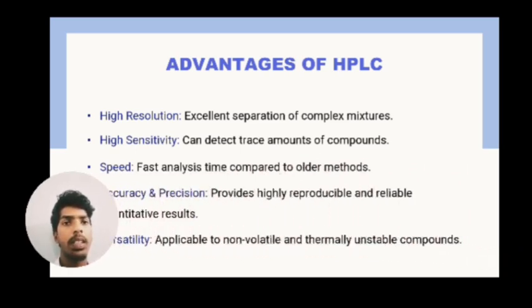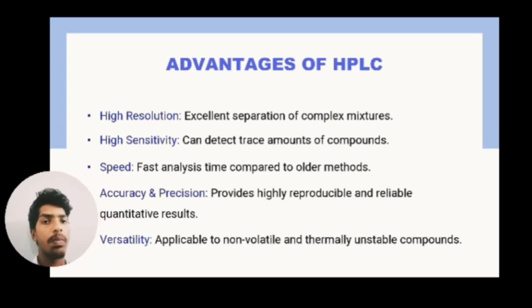Advantages of HPLC: high resolution, excellent separation of complex mixtures; high sensitivity, can detect trace amounts of components; speed, shorter analysis time compared to old methods; accuracy and precision, it provides highly reproducible and reliable quantitative results; versatility, applicable to non-volatile and thermally unstable components.